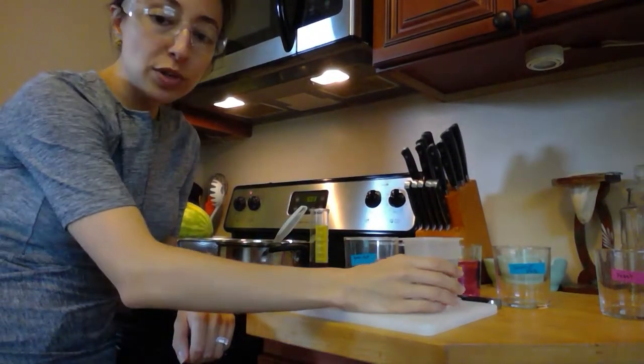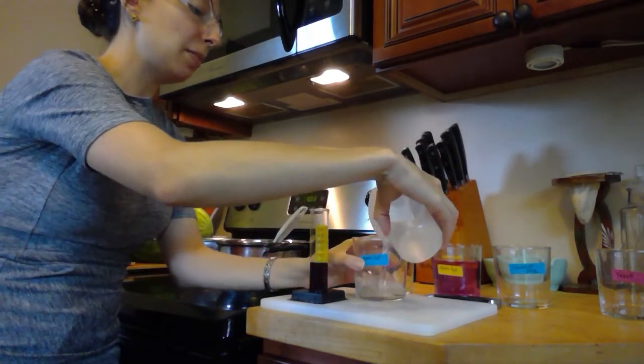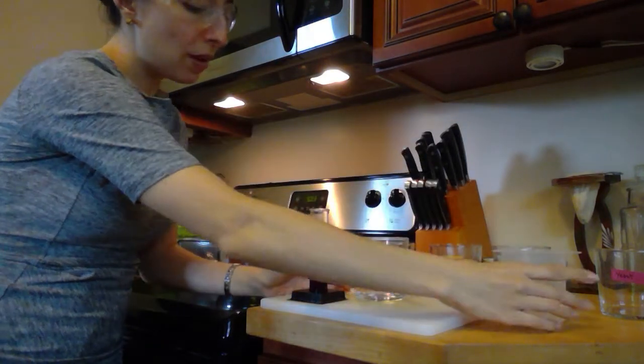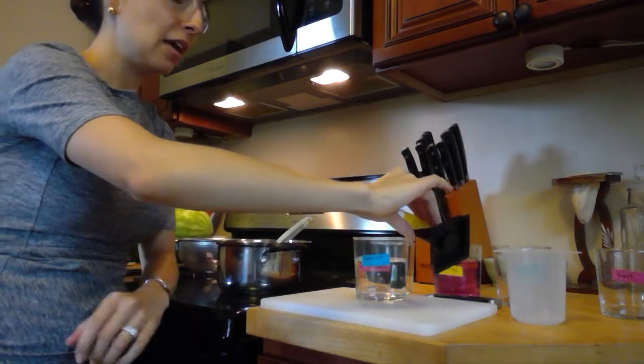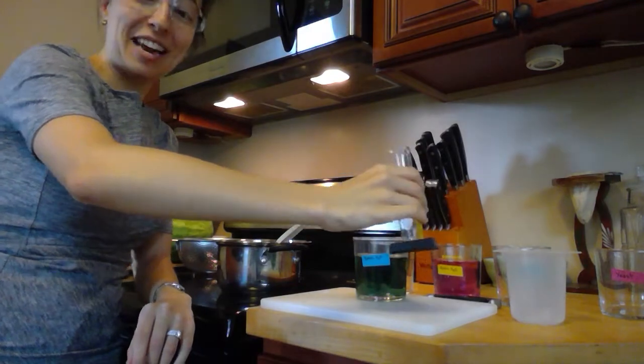Okay, I now have my 200 milliliters of my basic water that I'm going to be testing. I'm going to put it in my basic water sample cup. And then I have 25 milliliters of the indicator. So I'm going to go ahead and pour that in, and we'll see what happens. Oh, it's kind of fun.